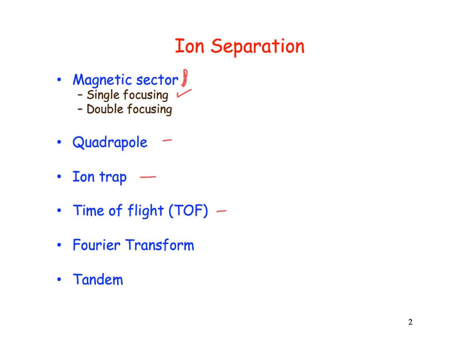Tandem mass spectrometry is essentially where you can hook together more than one mass spectrometer. So you separate an ion, and then you can select one of those ions, and you give it a chance to fragment, oftentimes due to some kind of collisions, and then you follow those ions. And so that can be useful as well.